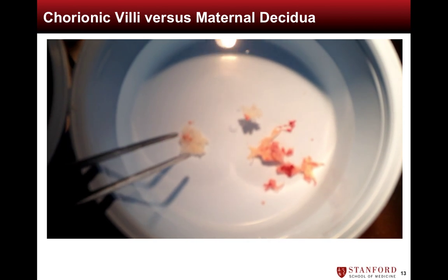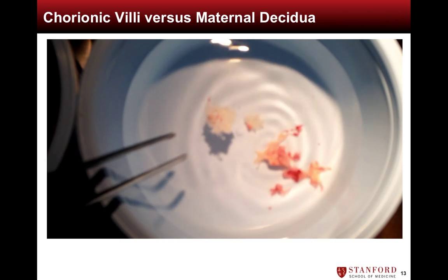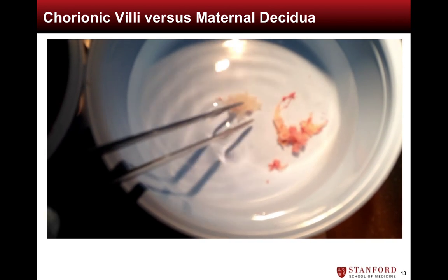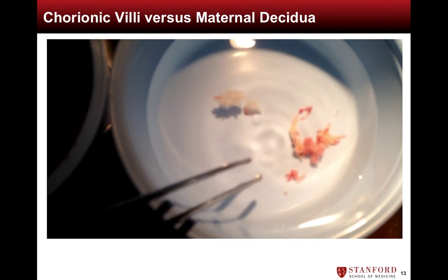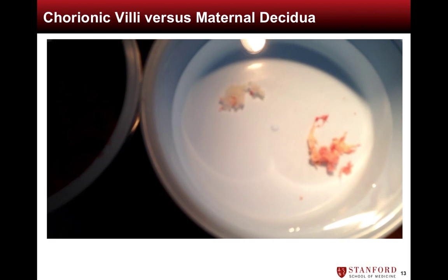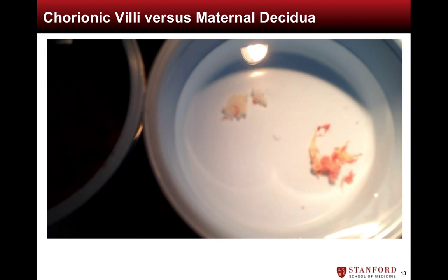Identification of villi and decidua can be further confirmed by comparing the densities of the two in normal saline. The villi on the left float, while the decidua on the right quickly sink. Once villi have been isolated from the miscarriage specimen, the next and final step is dissection of decidual tissue off the villi.